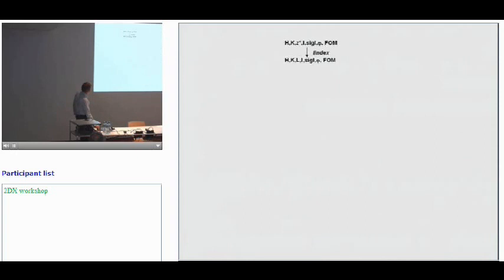So the first thing here is that after the electron crystallography processing, we are left with HK Z-star information along the lattice lines. I should also say that this scheme doesn't represent an actual case.